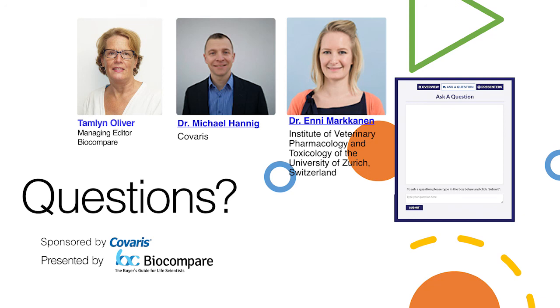Usually they can even fit 2 sections onto one of these slides that we use for LCM. So you prepare 2 slides with 3 to 4 sections. Sometimes after isolation from 2 of the sections, you already have so much material, and at some point you have a feeling for what is enough and what is not enough, that they just stop after isolation from 2 sections. Sometimes it really goes up to 4 sections, but rarely do we need more than that.